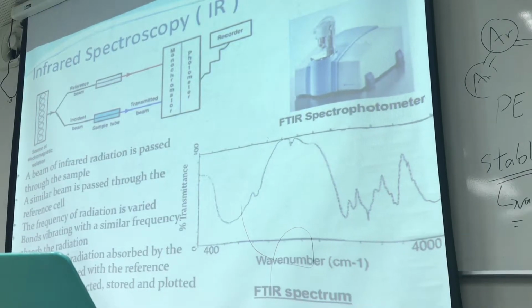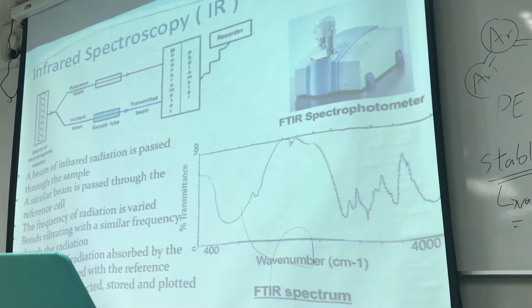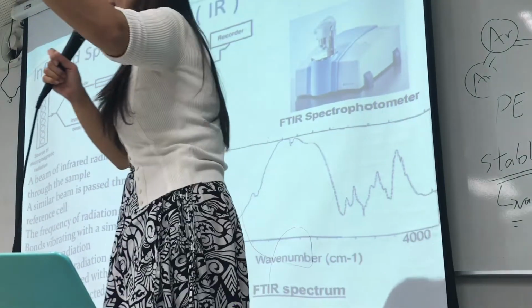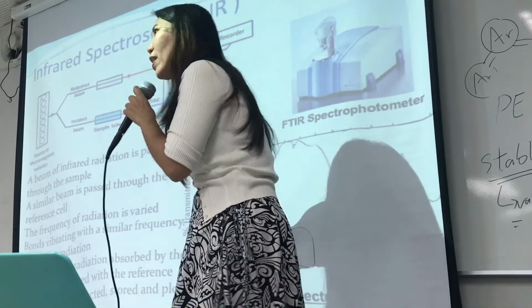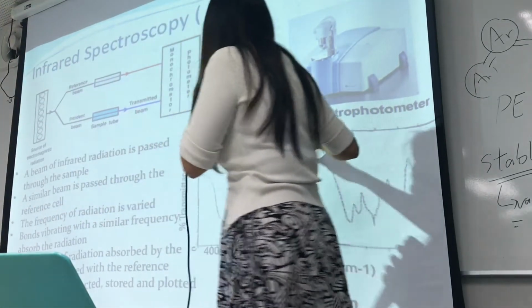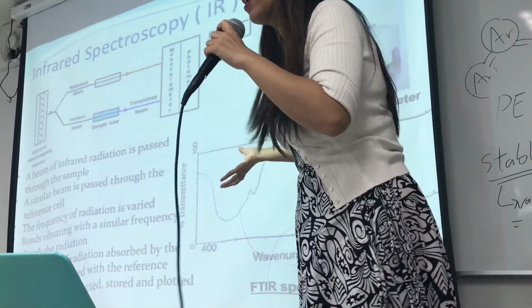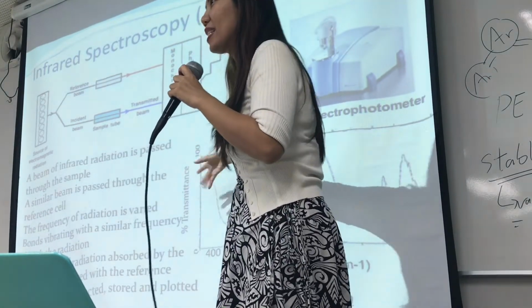And how would you know what kind of bonding is at each of these drops? How do you know? Database again. You go and check, and you see, okay, at a frequency of 400, then it's C and C bonding, right? And how about here? That is C and H bonding or whatever. You see that? This one I'm guessing, it might not be C and C.